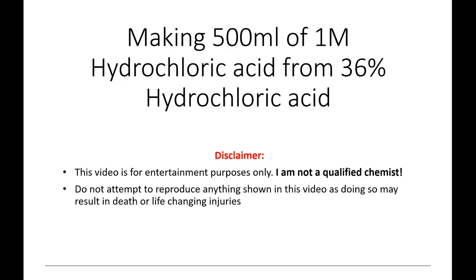This video explains how to make 500 millilitres of 1 molar hydrochloric acid from 36% hydrochloric acid. Note that this video is for entertainment purposes only. I am not a qualified chemist. Do not attempt to reproduce anything shown in this video, as doing so may result in death or life-changing injuries.